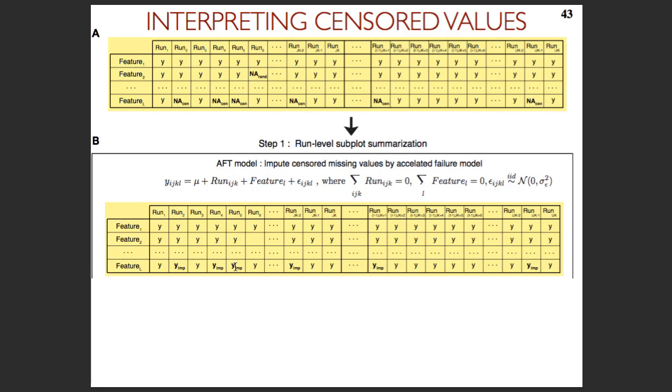Well, what you're actually saying, and this is something kind of outside of what we can talk about here, is you change the way you estimate the mean. You use an approach called maximum likelihood to estimate the mean. For data that you observe, you use your data. For data that you do not observe, you say it's a range of values below a cutoff, and you weigh this essentially according to the probability distribution. If you assume that there's a normal distribution somewhere, you will say some probability associated with this range.